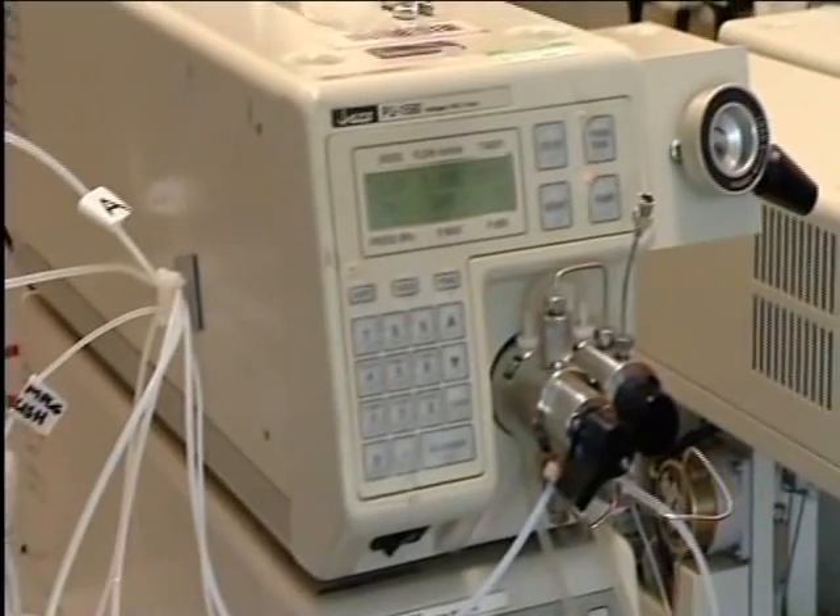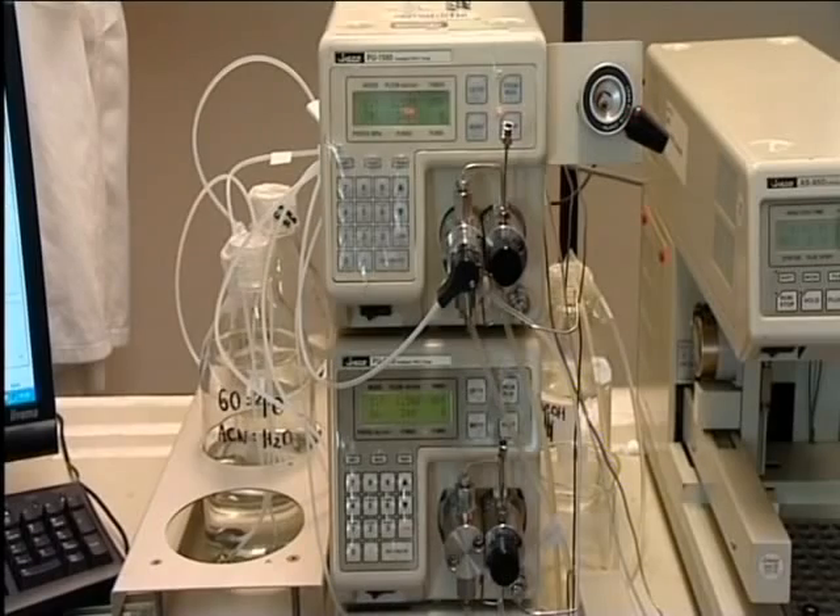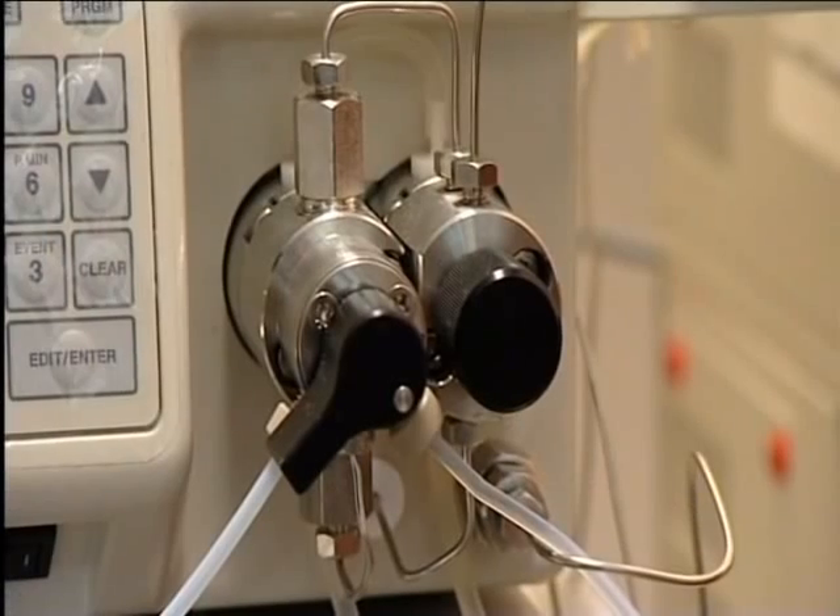These are the pumps. They produce a pressure of 15,000 kilopascals, 150 times that of the atmosphere, hence the name, high-pressure liquid chromatography.